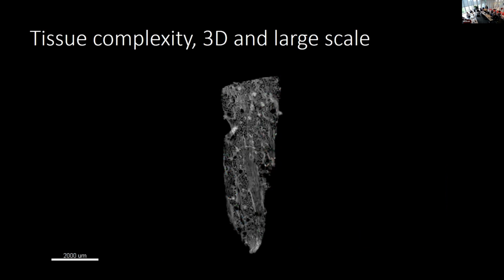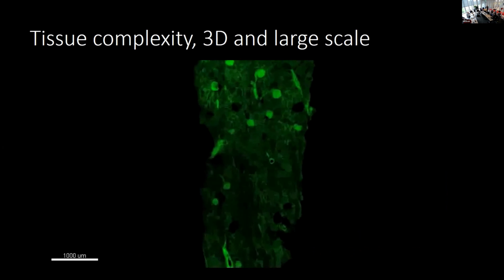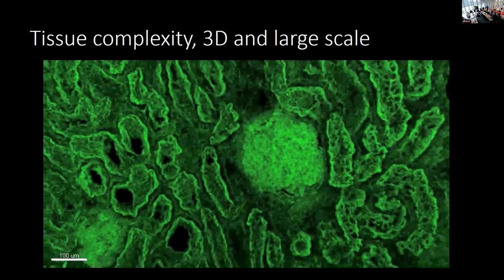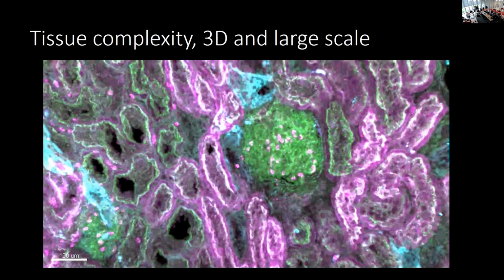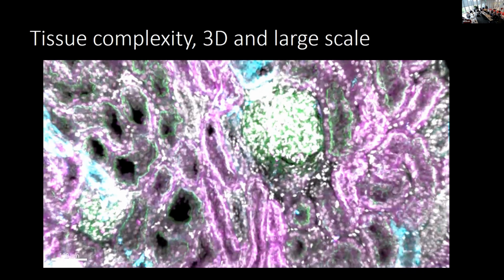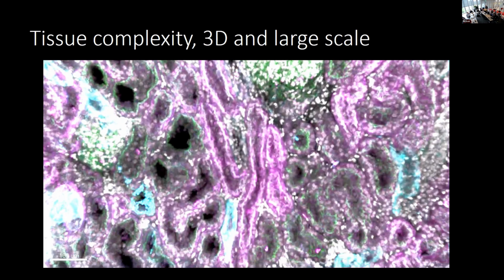As Simon Watkins very elegantly showed us, the complexity of tissue is not at that small level. We're at much larger scales, at mesoscales. Even the kinds of tissues that we'll be analyzing and collecting in the KPMP are on this scale. We're looking at up to 1 centimeter in length or more and 1 millimeter or so in diameter.